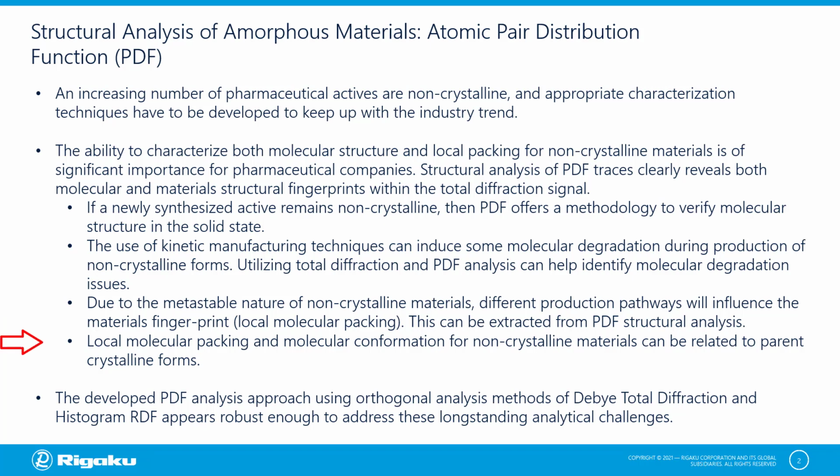As a last point, which is important for IP and for those of us who do molecular modeling for polymorph identification, local molecular packing and molecular conformation inside the non-crystalline materials can be related to parent crystalline forms.